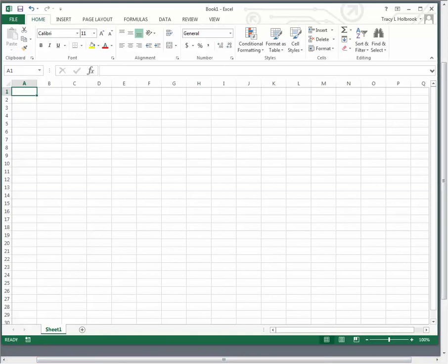So here's Excel. And to make a calibration curve, it's very easy. If you have all the data that's in front of you, it's very easy for you to do. There's two columns here, column A and column B. That's really all that we need to mess with. And column A will get the concentration. So I can put here concentration, and it's going to cut that word off or not include it in the entire cell.